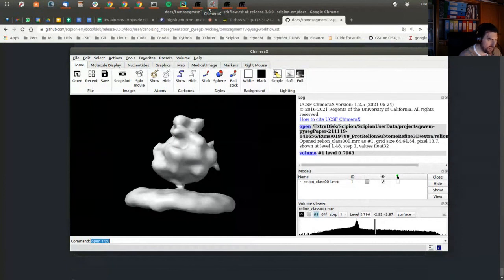Yeah, I think it was about 50 or 54. I think it was the resolution of this. So the limit, 3 times that, is about 140 or so. Yeah, unless you are able to process more particles, you cannot start to think about it. Sure. I'm quite impressed about the result obtained.